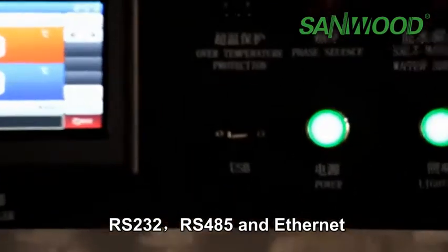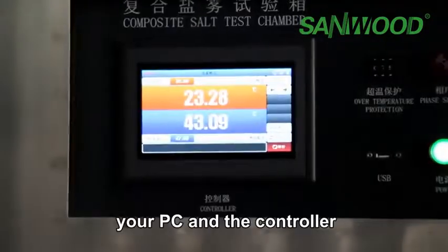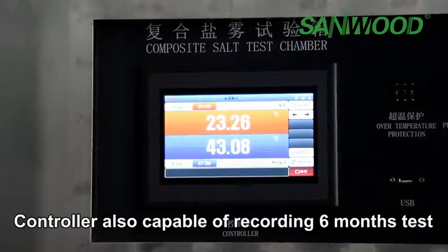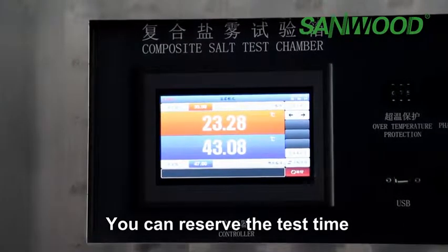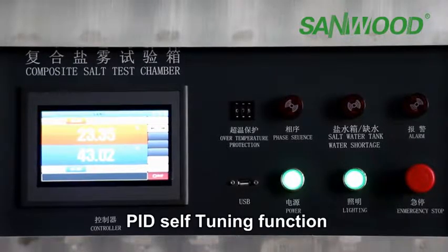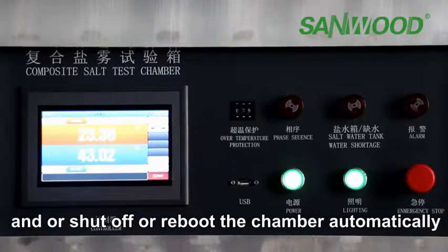Each group has 99 segments and 999 cycles in total. The controller has three kinds of communication ports: RS232, RS485, and Ethernet. You can choose one of them to connect your PC to the controller and control the chamber from your PC. The controller is also capable of recording 6 months of test data and long histories. You can resume the test time after saving the test program, and the chamber can run the program automatically. It also features a PID self-tuning function, and the controller will identify failure reasons, solutions, and automatically shut off or alarm the chamber.